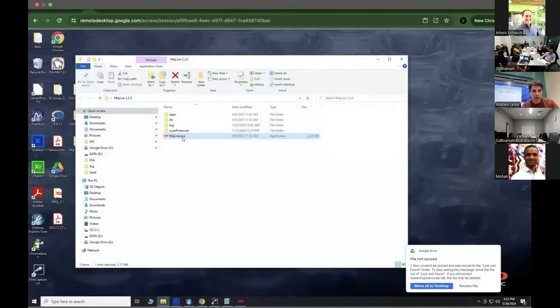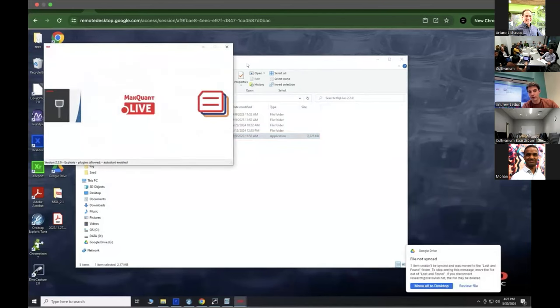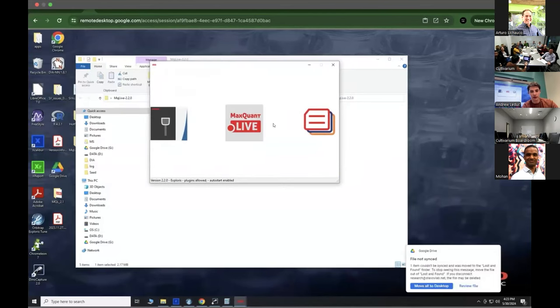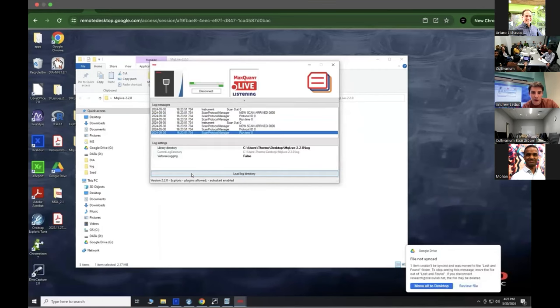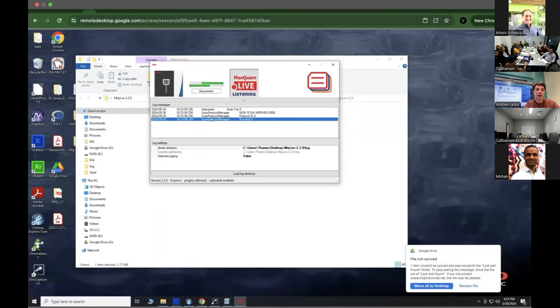Anyways, we open up the folder with the software we downloaded from the internet. We have our API code, and we open this executable. It's very simple, pretty simple software, with three different buttons. This one is the instrument, and you can see a picture of an Explorer. This is on an Explorer, so I'll click the Explorer and connect it to the instrument with this button. I don't know if this will work right now, the power shut off in our lab, but okay, it's working. So that's great. This middle tab is a log.